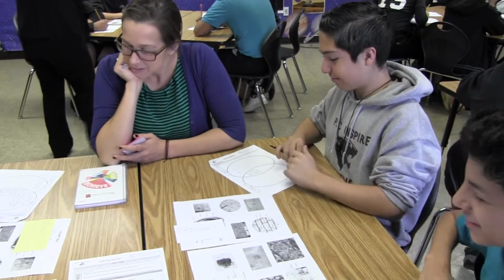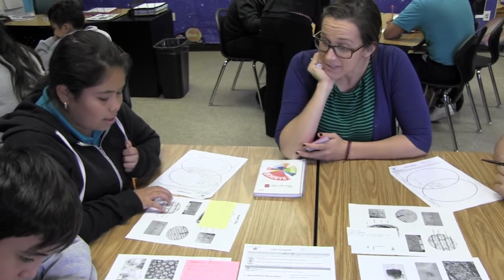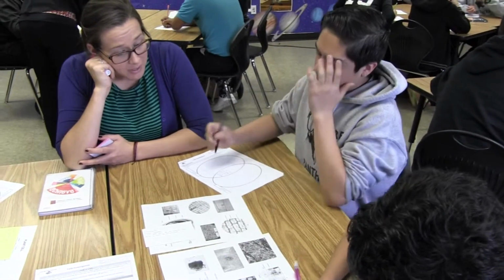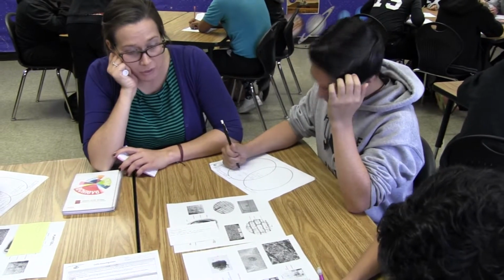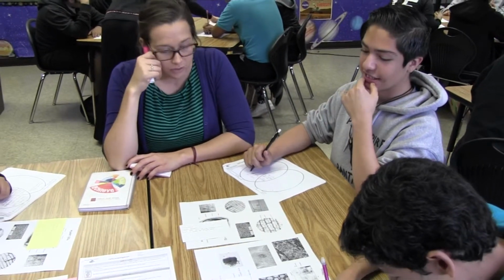This is where the cells are in the leaf, right? Because these are different plant cells. It does look brick-like, so write it down. When you get your unknown pictures in a moment, that might help you distinguish: is this a plant cell or an animal cell? What else do you see that's special? What do only animal cells or only plant cells have?